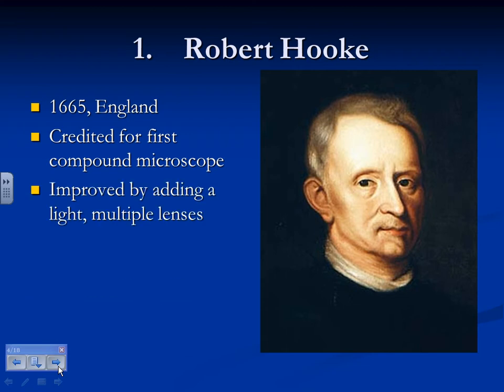The next big thing he did was he added lenses. Lenses are what do the magnifying. Before him, there were what were called simple microscopes. What's the difference, simple versus compound? Simple, you can see smaller details, more HD. Okay, we'll get to that in a second. Good job. A simple microscope was basically like a telescope. It had one lens, oriented so you could magnify, basically like a hand lens or magnifying glass. It can magnify to a certain point, but by adding an additional lens, you get additional magnification. And he added a light.